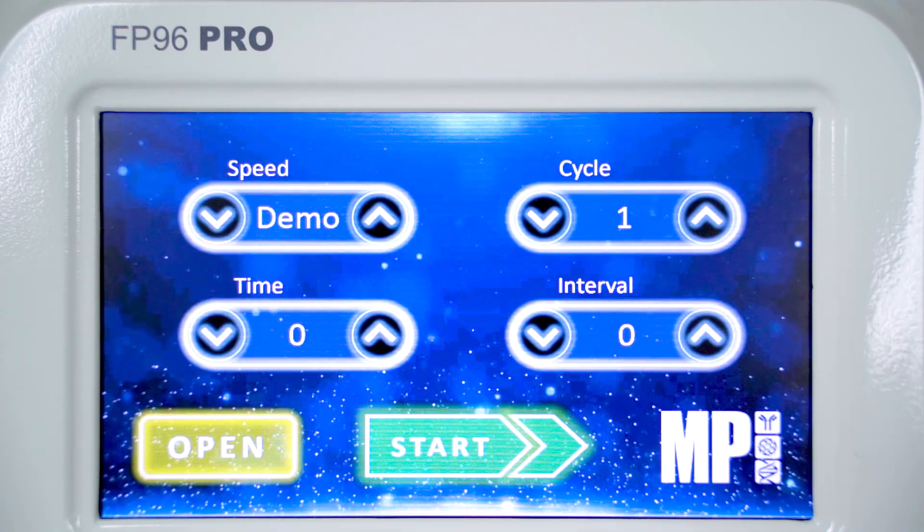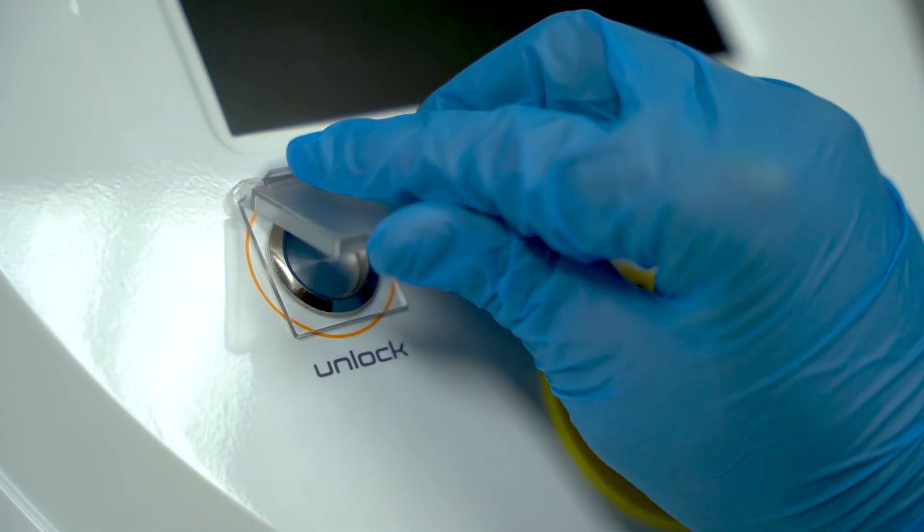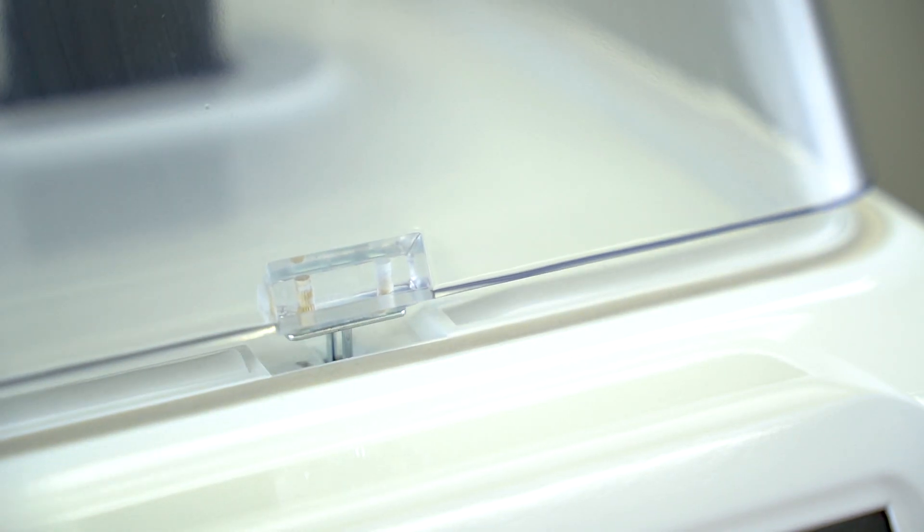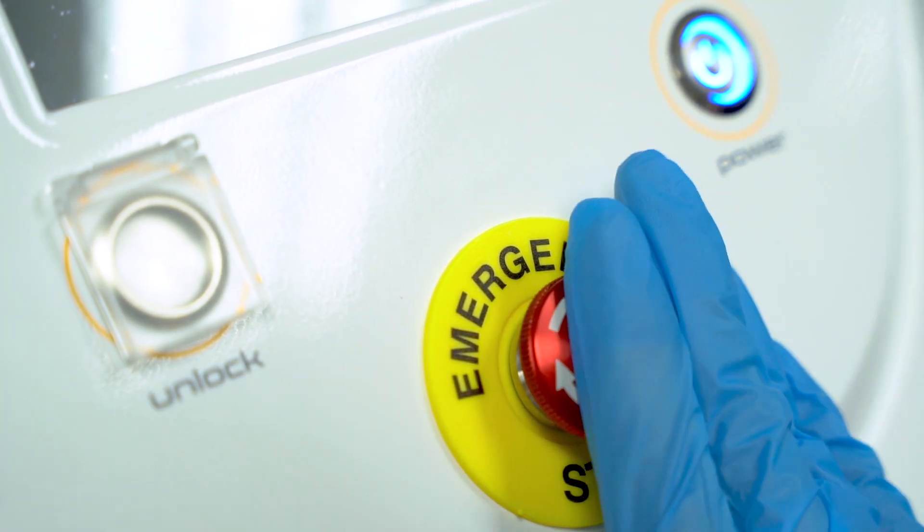In the event of a power failure, you can use the unlock button on the front of the machine to open the dome manually. If there's an emergency, simply hit the emergency stop button at the front to halt any ongoing actions.